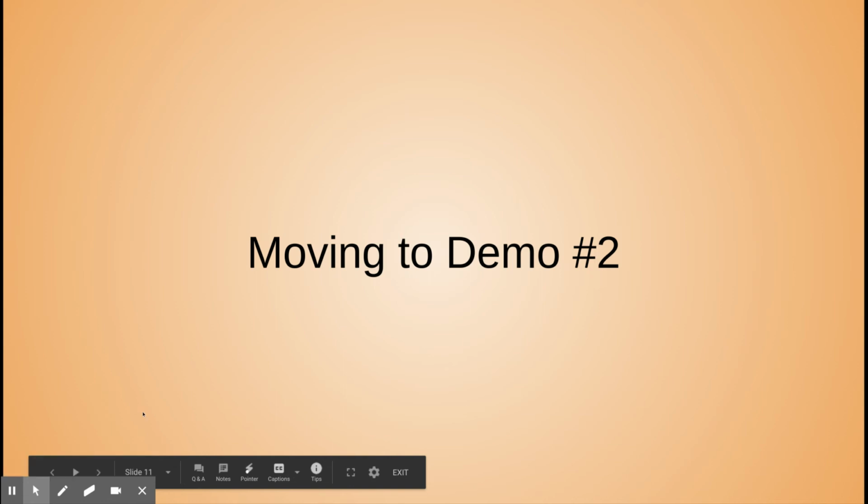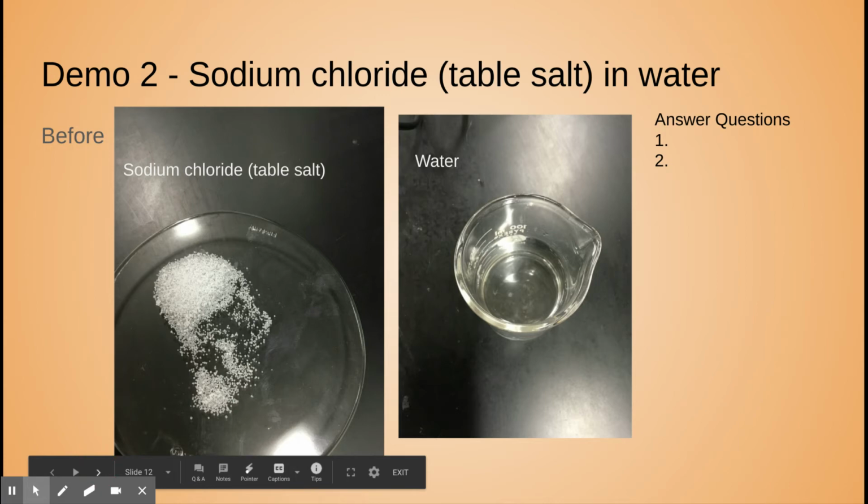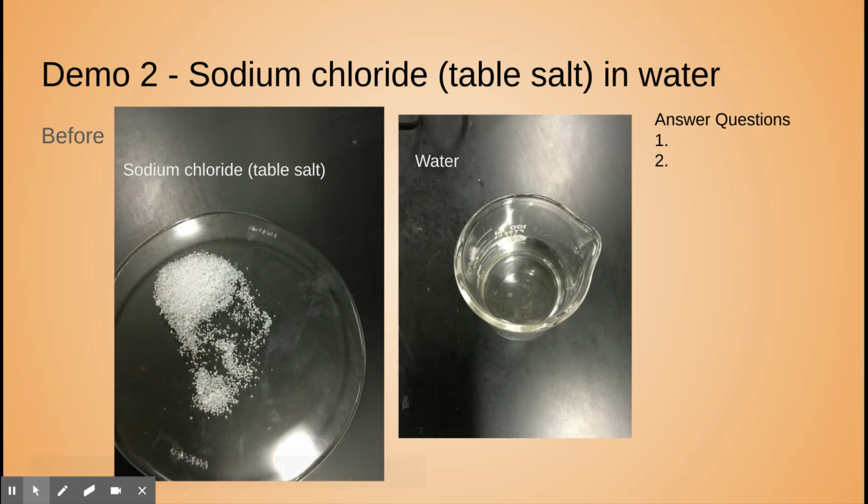All right, moving on to demo number 2, which is going to be sodium chloride, which is known as table salt. It's your common table salt in water. So go ahead and answer questions number 1 and 2, which are the observations.